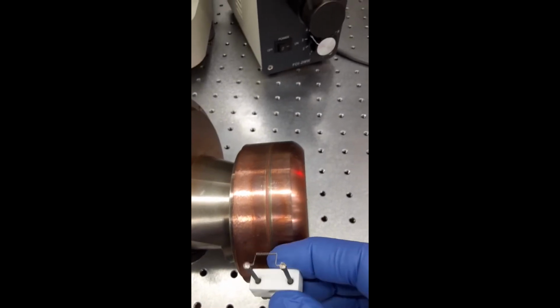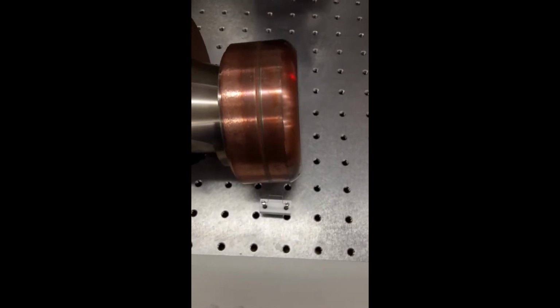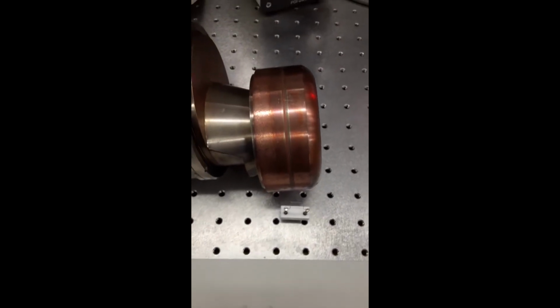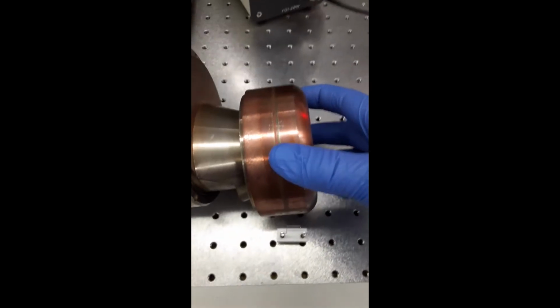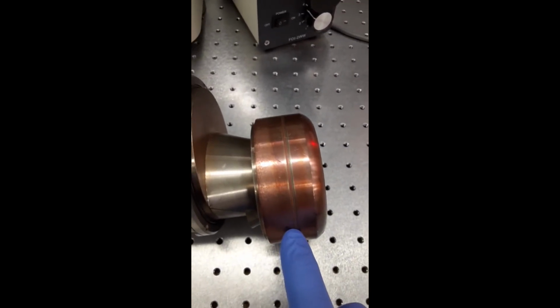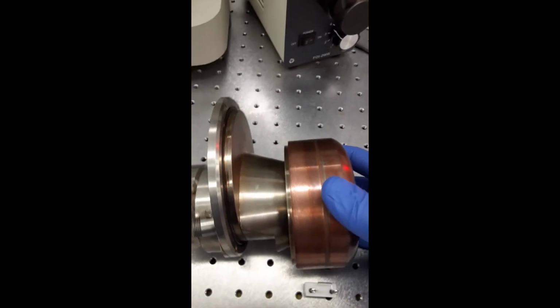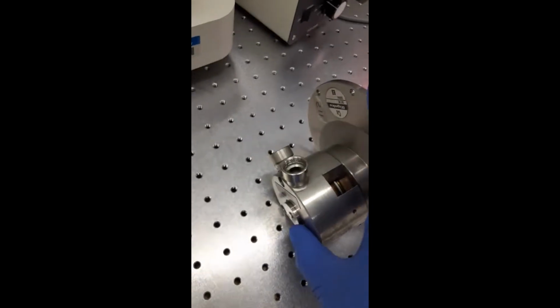Although this system produces X-rays, it is inefficient, and much of that electric energy is dissipated as heat. That is the reason this needs to rotate. If the electron source continually bombarded the same spot, it would quickly heat up and burn a hole in it. So the anode rotates, and also it's water cooled.